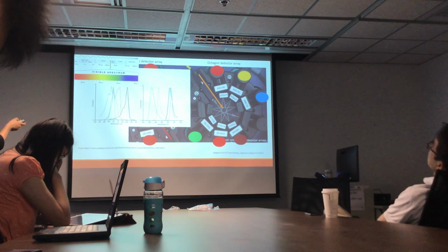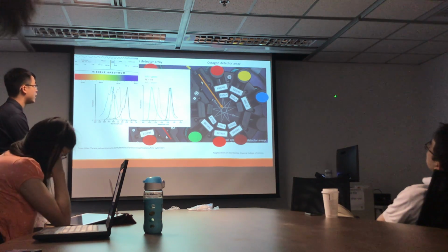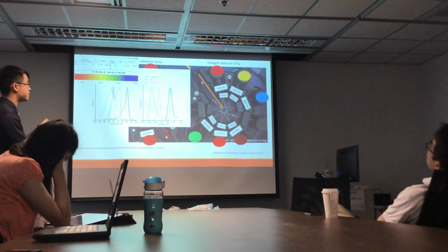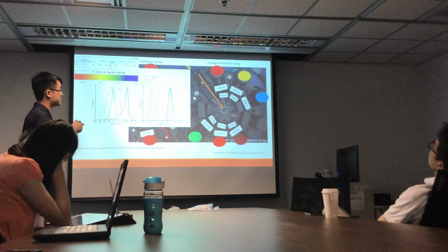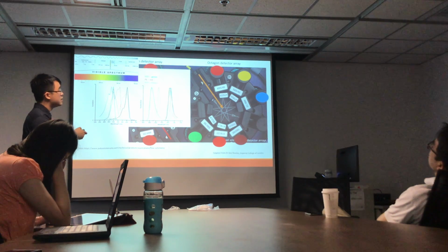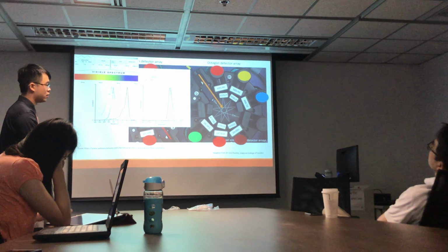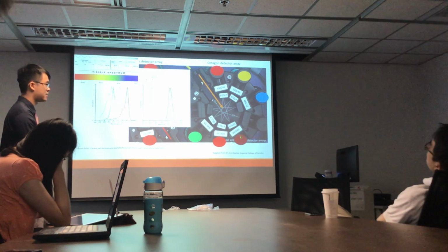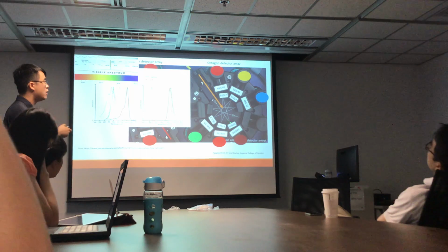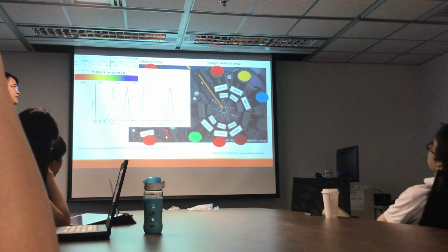Let's say when a light beam comes in, if the fluorescence comes in, it will first hit the 735 long-pass filter. If it's longer than 735 nanometers, it's able to be detected by the detector here, whereas if it's shorter than that, it will simply be reflected until it hits its designated detector.